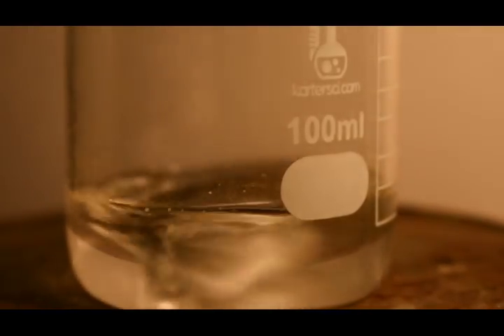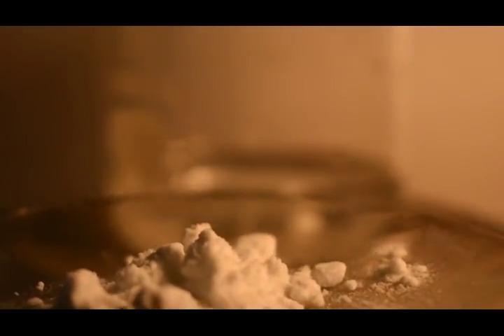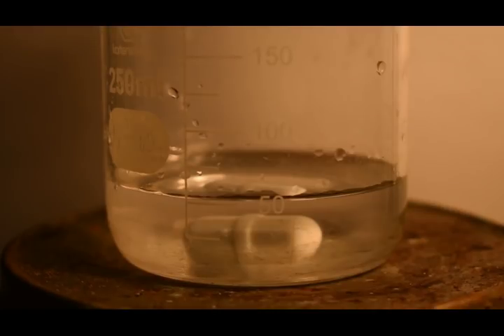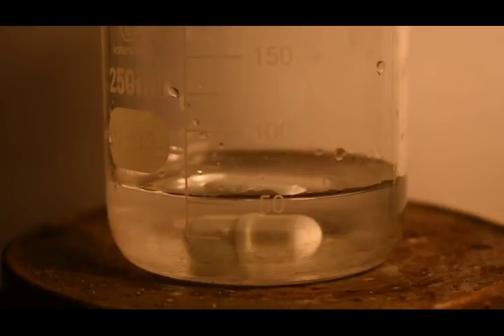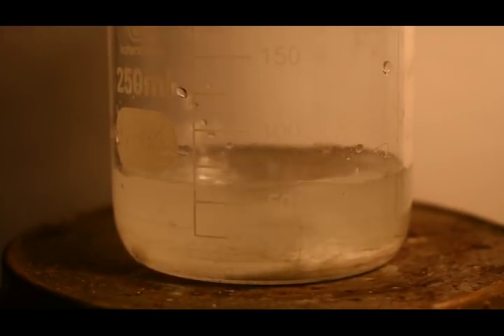Now that everything's dissolved, I'm going to go ahead and stop the stirring and take this off. And we'll go ahead and get our next solution prepared. What we'll need next is potassium persulfate. This was generously donated by Tom's Lab. The synthesis that I'm following calls for 1.5 grams, but in my past experiences, that hasn't really been enough because there's still been silver left over in solution. So the synthesis called for 1.5 grams, and I just upped it to 2.2 grams. I'm going to go ahead and add this to 50 milliliters of distilled water in a beaker and stir to dissolve.